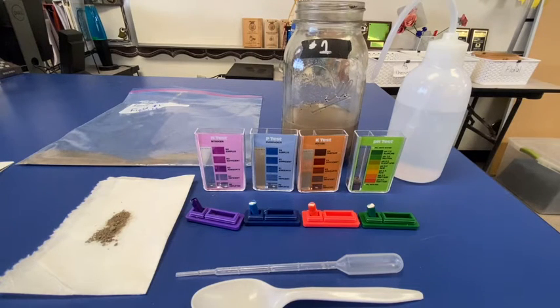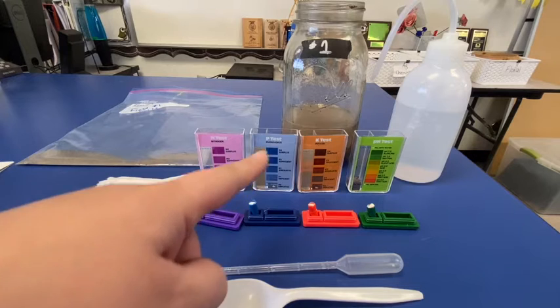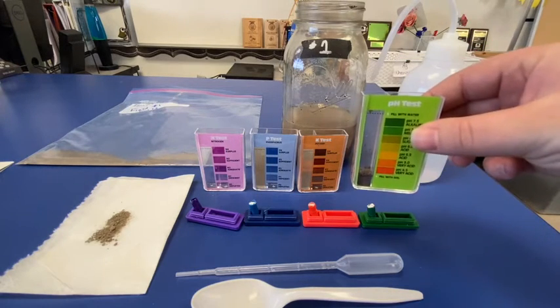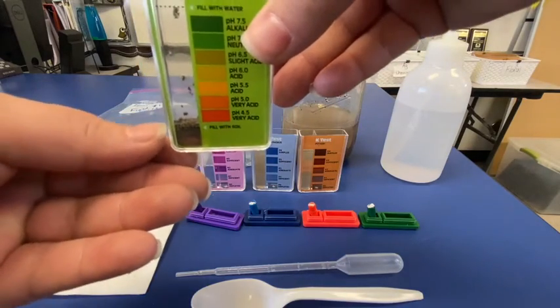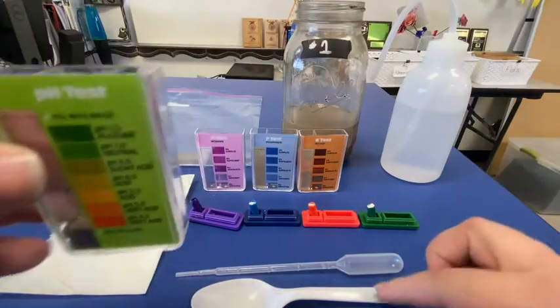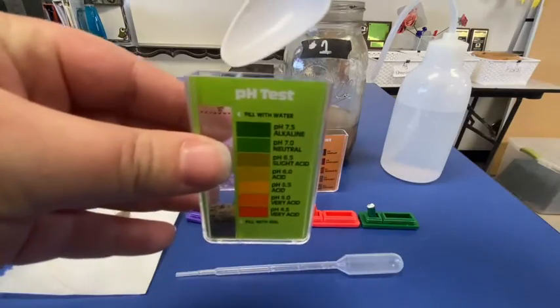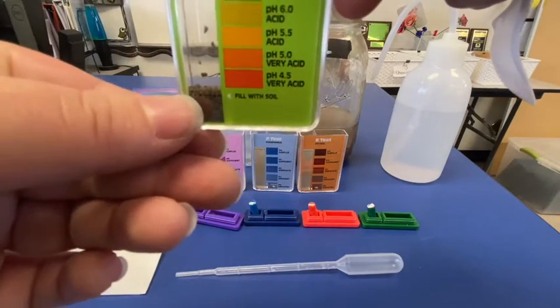We have let that set for 48 hours, so now we're going to be testing the pH, the nitrogen, phosphorus, and potassium or potash levels. First thing I'm going to test is our pH test. So we take our indicator, and I have put our soil to the fill line. I used my spoon, grabbed our soil, and filled it to that fill line — there is a bottom fill line right here.